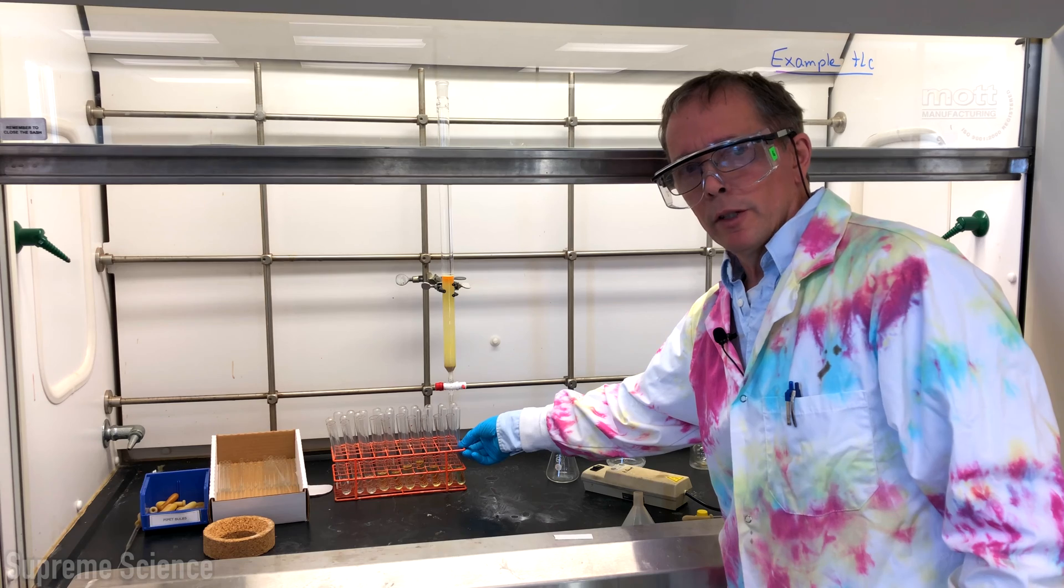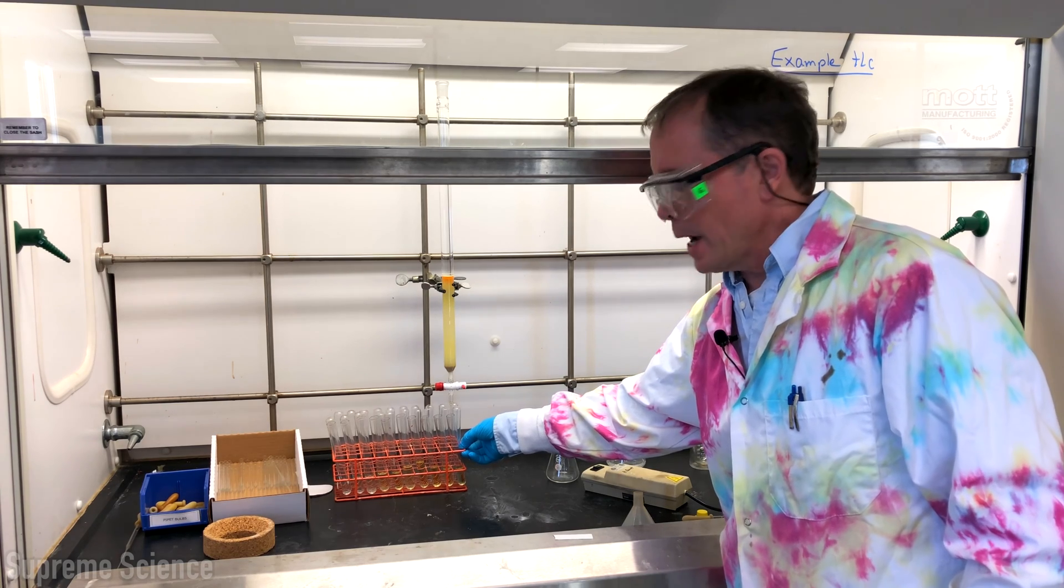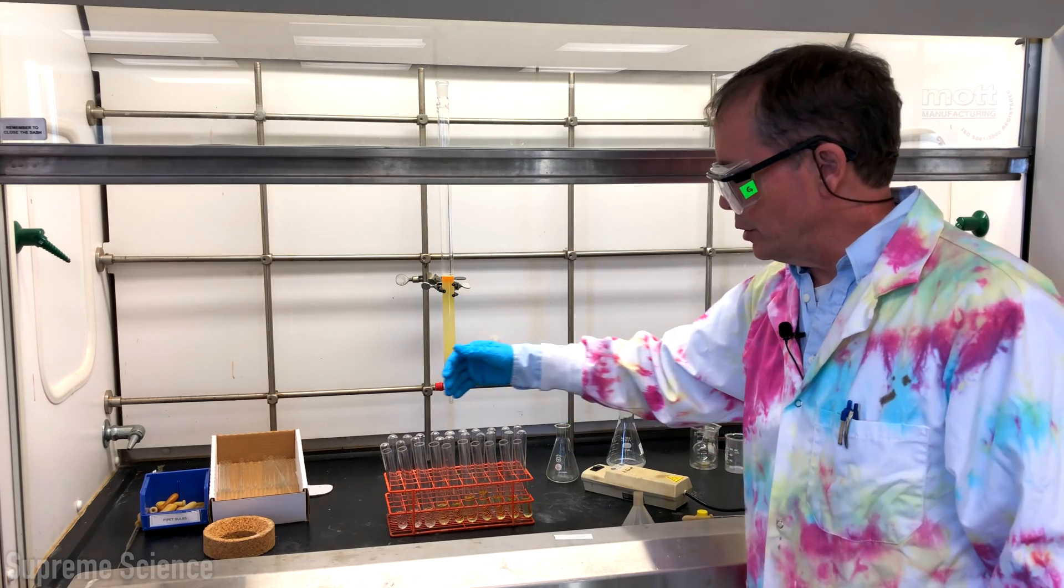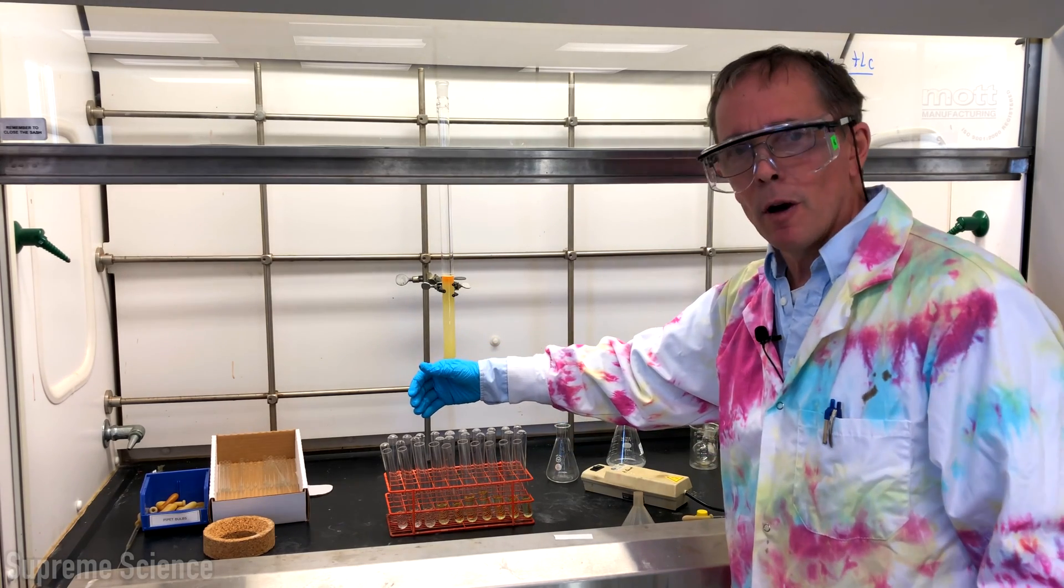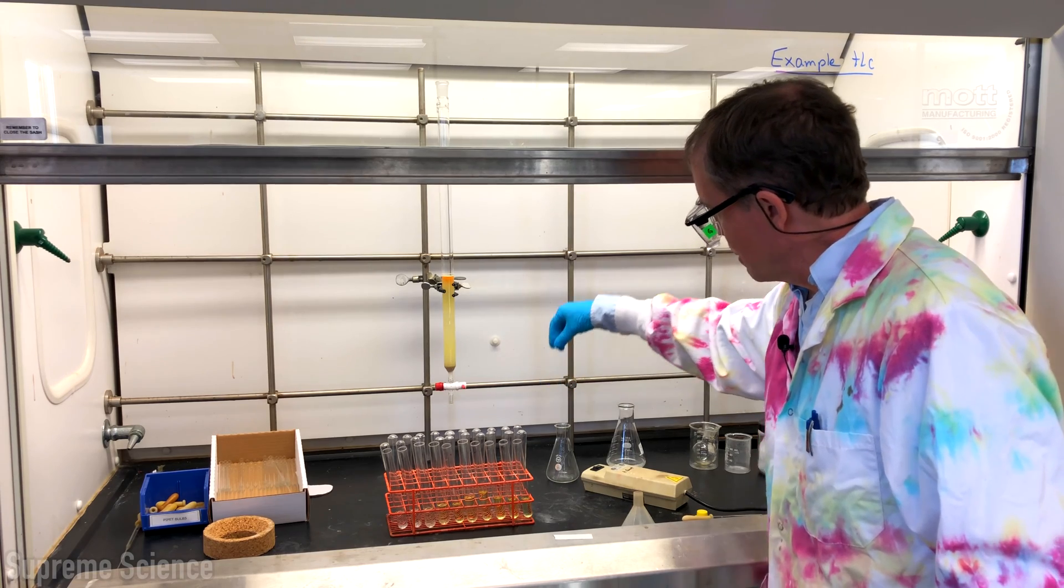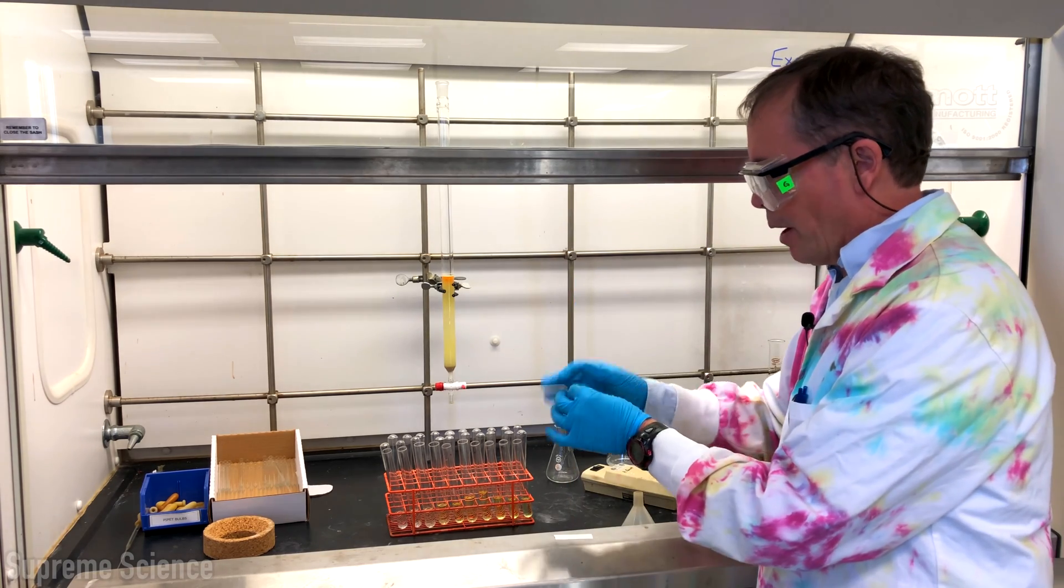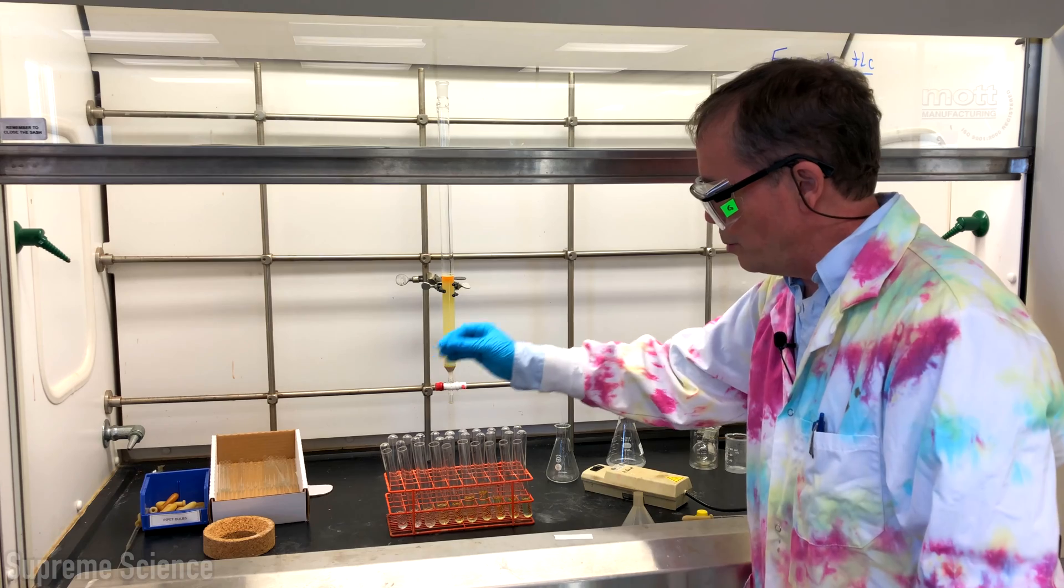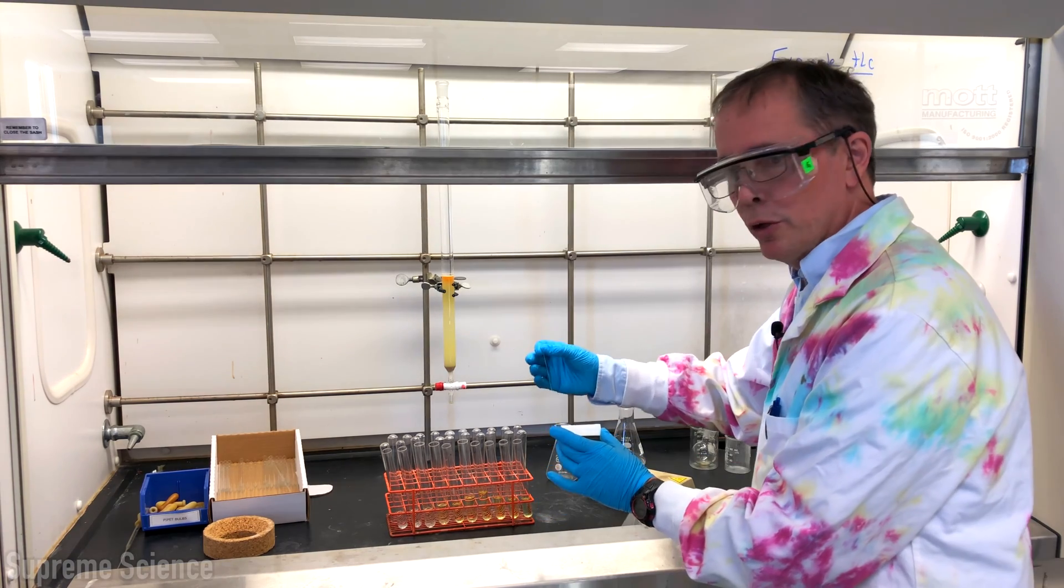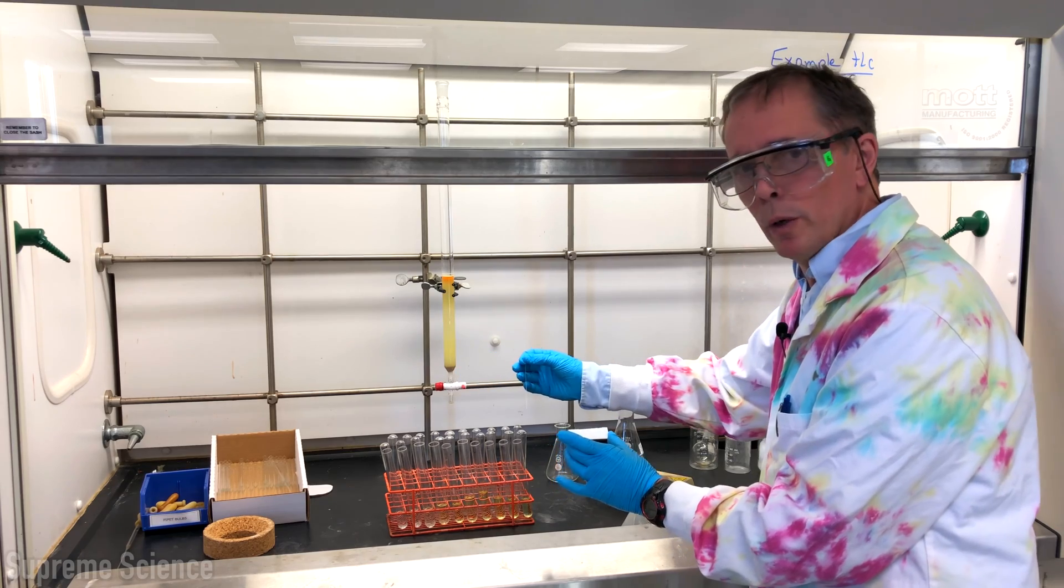Our column has run as expected. We've collected 10 fractions. And now we're going to quickly survey these fractions to see if we can find the compounds of interest in them. We'll take a spotter and spot every second tube onto a TLC plate like this. Look at it under UV in order to determine in which fraction we'll see our compound.